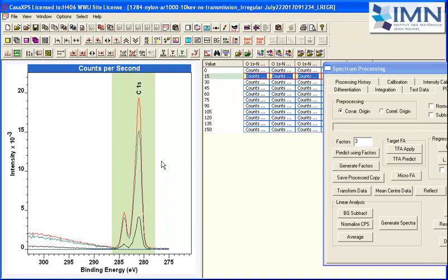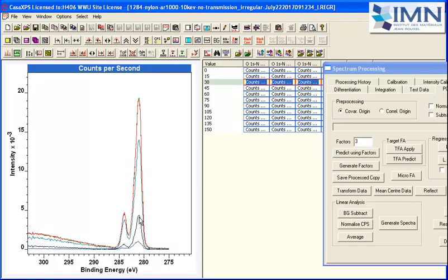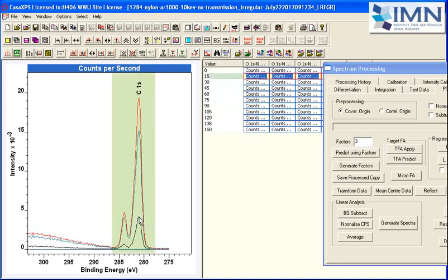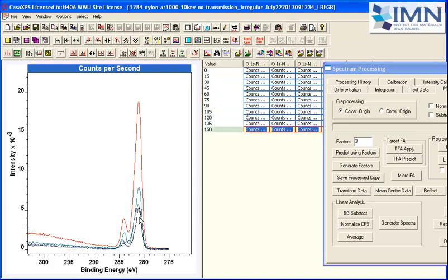So the idea would be that this one here would represent the nitrogen, and this one represents what has changed as a result of etching the sample. And then as we carry on etching, you can see that this is well represented by these 3 component peaks, and what happens is you end up with an evolution of that one that I just calculated from the least squares solution for the last vector.